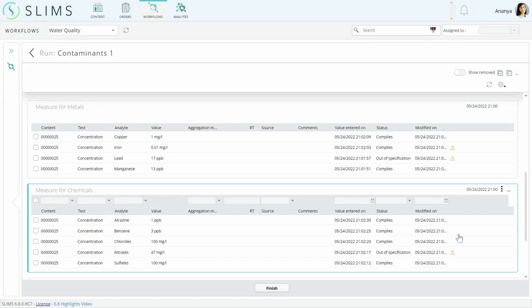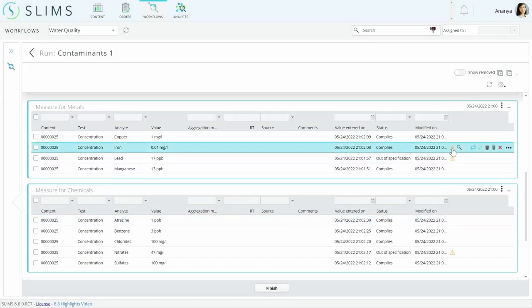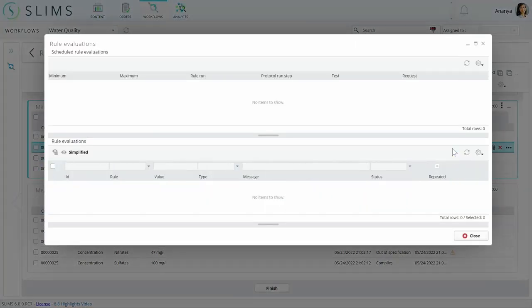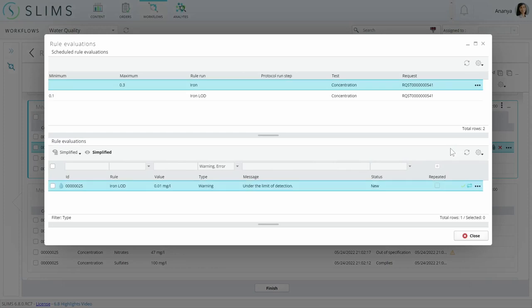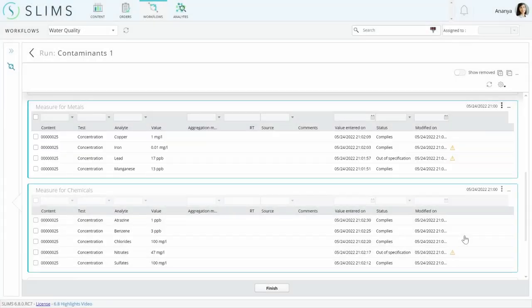Then there's a custom warning on iron that lets the user know when the result is below the limit of detection. Since it's informational, it doesn't need to be an error.